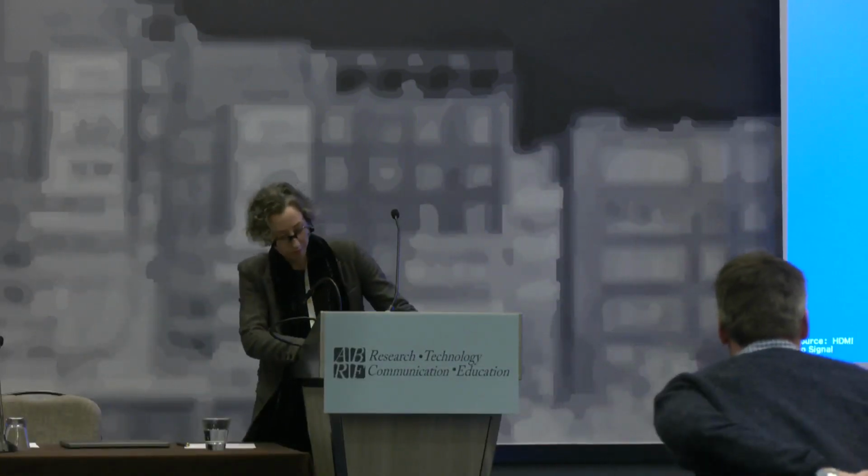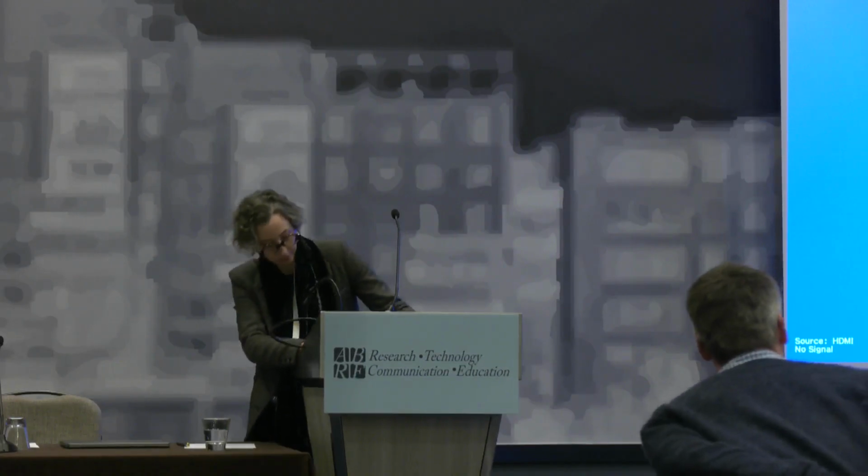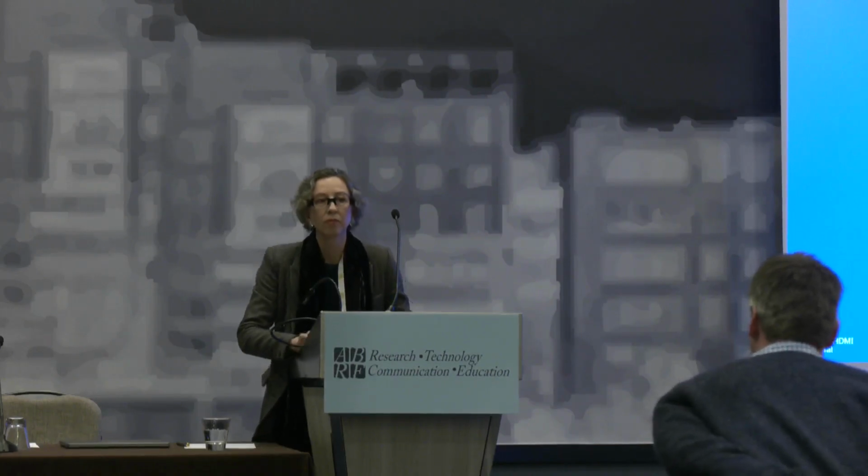Yeah, thanks so much for that talk, and I couldn't agree more with the last point you made. I had a question about your AFM, which you kind of touched on very briefly. So you use it for kind of molecular imaging. Do you use it for viscoelastic measurements as well? Biomaterials? So AFM is such a powerful tool. I mean, wildly powerful. What I showed was just a very basic, here's the topography of the surface we're looking at.